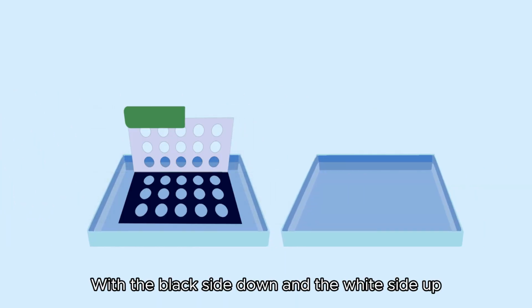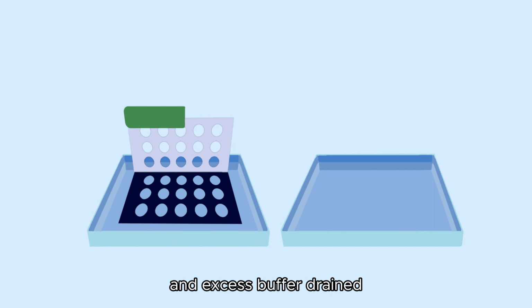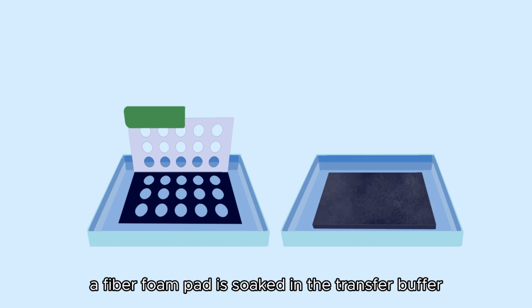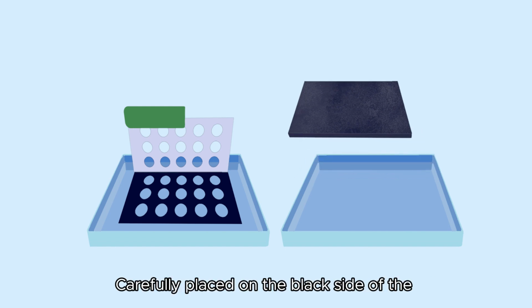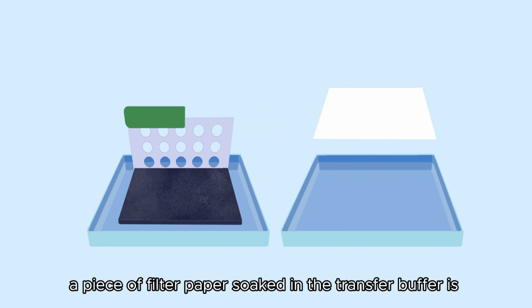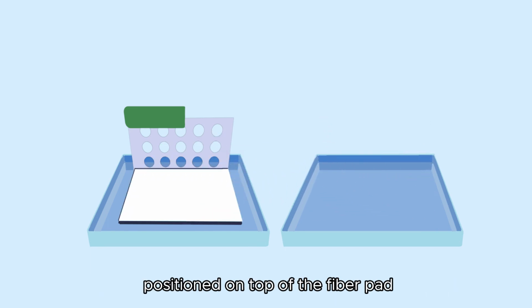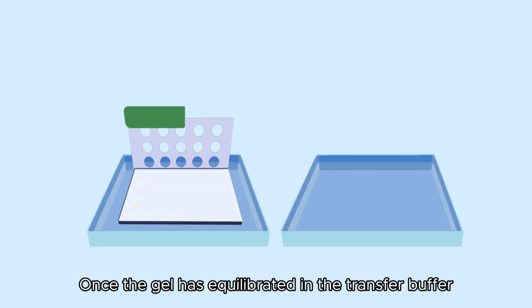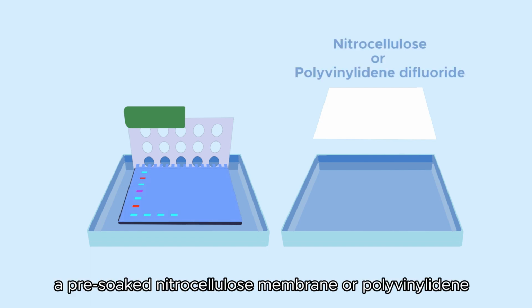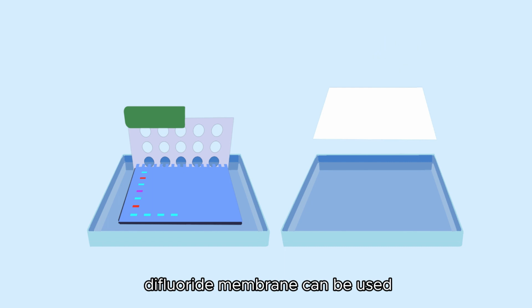With the black side down and the white side up, and excess buffer drained, a fiber foam pad is soaked in the transfer buffer. Carefully placed on the black side of the gel holder cassette, a piece of filter paper soaked in the transfer buffer is positioned on top of the fiber pad. Once the gel has equilibrated in the transfer buffer, it is meticulously laid on the blotting paper.